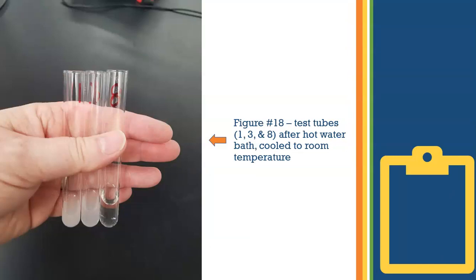The 3 test tubes were removed from the hot water bath, cooled to room temperature, and these are the final results for those 3 test tubes.